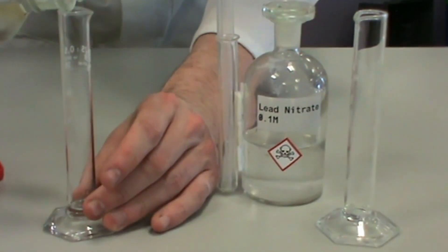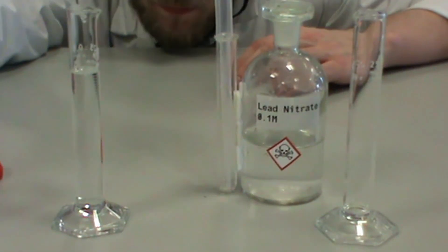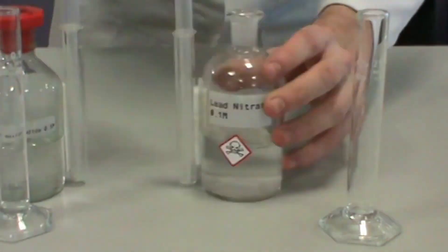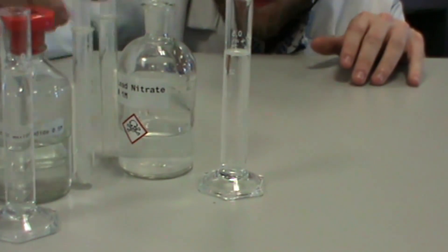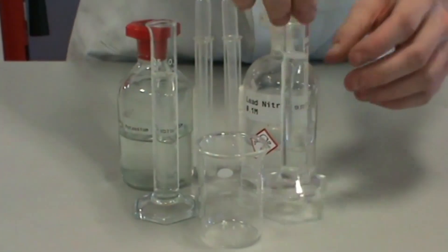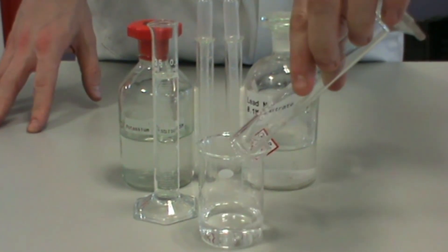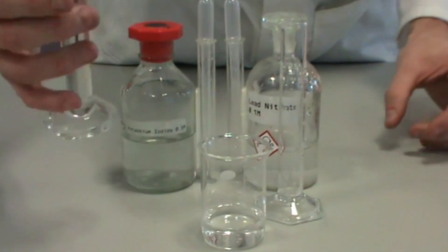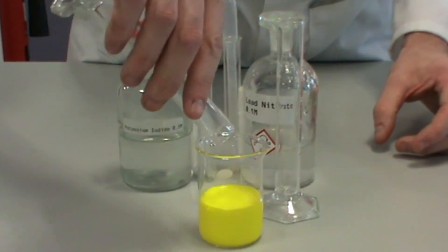Pour 25cm³ of potassium iodide solution into a 25cm³ measuring cylinder. Then pour 25cm³ of lead nitrate solution into a separate 25cm³ measuring cylinder. Pour your 25cm³ of lead nitrate solution into a 100cm³ beaker, then add in your 25cm³ of potassium iodide solution.